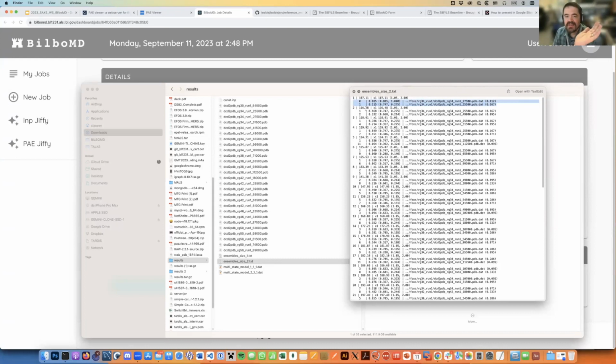And the next best choice would be these two here, and this one is 68% of your ensemble, and this one's 33%. I think that's how you read them. But then there's these other numbers in here, which I don't remember what they are, and this one out here, I don't know what those are. These numbers here, I don't know what those are. And those numbers there, I don't know what those are, or that number there. There's a chi-square, and there's.